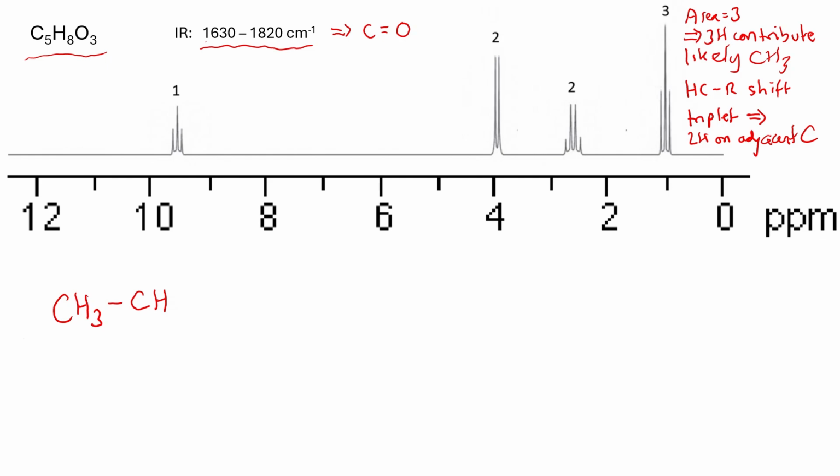So we've got CH2 here, and remember that carbon has 4 bonds. So if you've only got CH2 there, there must be a bond to something else.